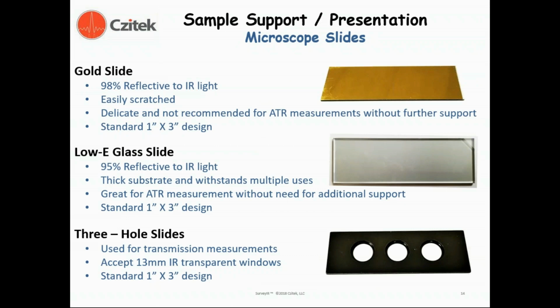One thing that we did not mention or show a picture of in the presentation, that I want to point out right up front, is that common 1x3-inch glass microscope slides are indispensable substrates for sample preparation. They cannot be used as substrates for infrared microspectroscopy analysis. However, they are very inexpensive, disposable substrates that you use in the initial manipulation and preparation of samples before transferring those samples to an appropriate substrate for infrared measurement.